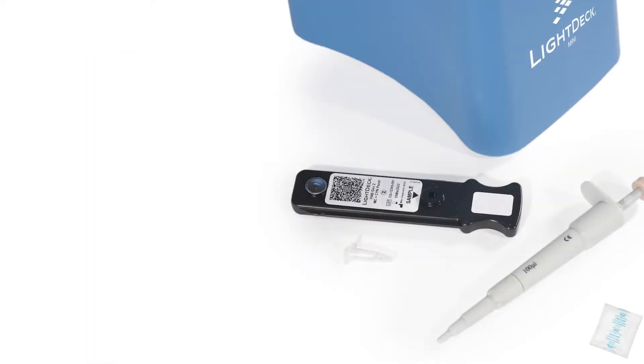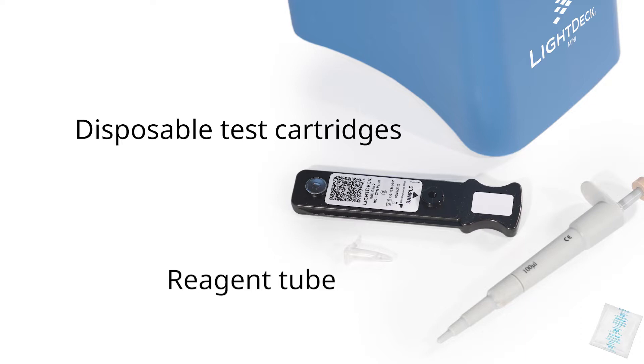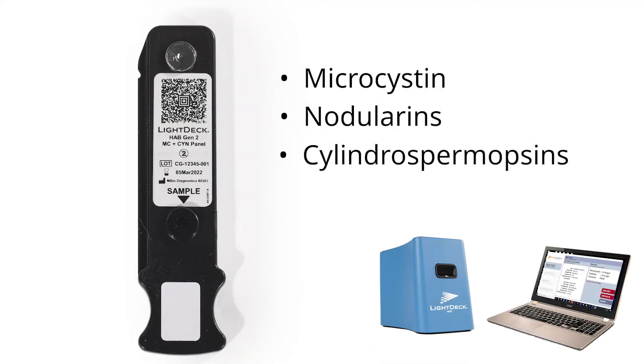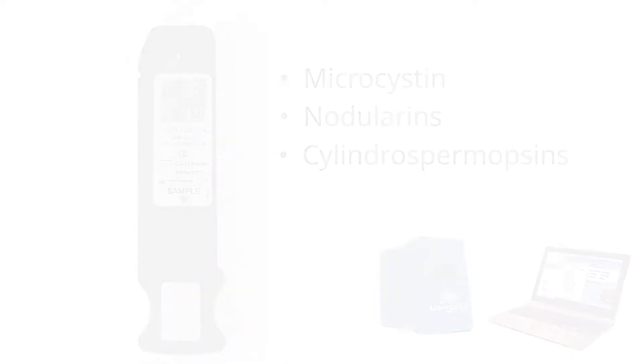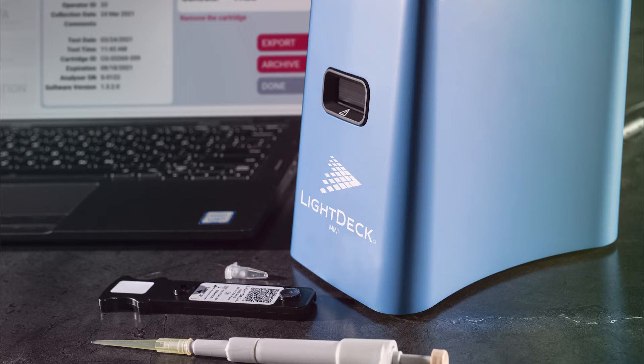Within the packaging for each test cartridge, you will find a cartridge, reagent tube, and desiccant packet. Each test cartridge is designed to measure microcystins, nodularins, and cylindrospermopsin simultaneously. All of these materials will be used in this tutorial.